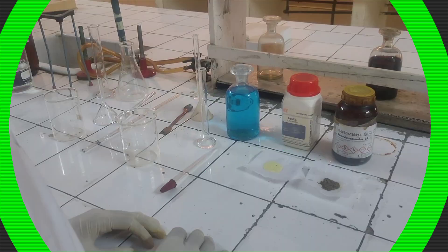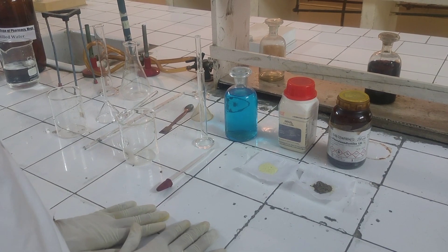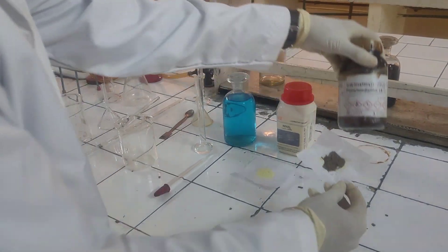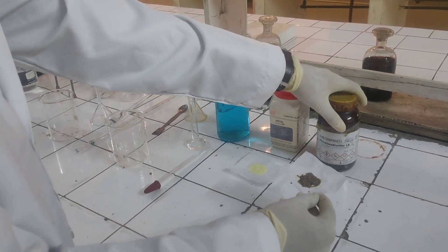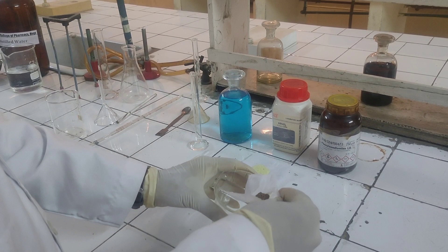Now you can see the synthesis of 2,3-diphenylquinoxaline. First of all take 1.1 gram of orthophenylenediamine and transfer it into beaker.